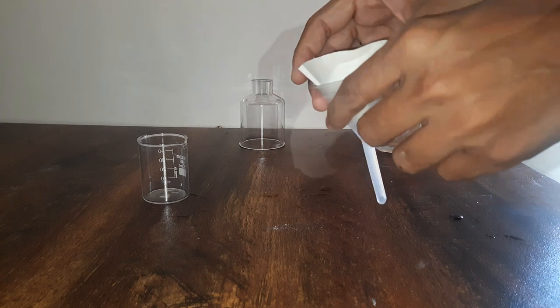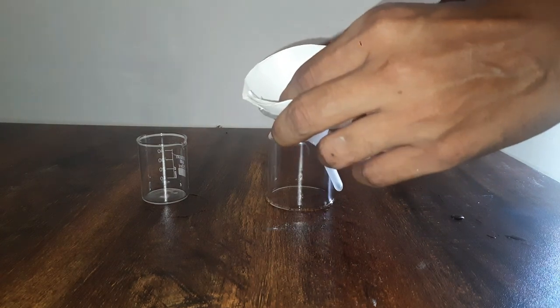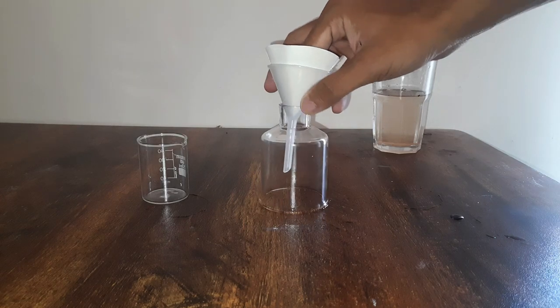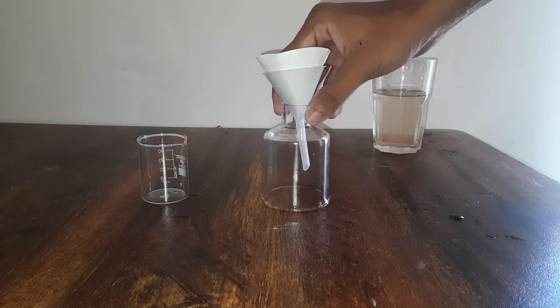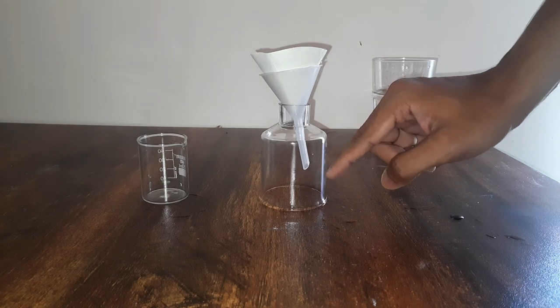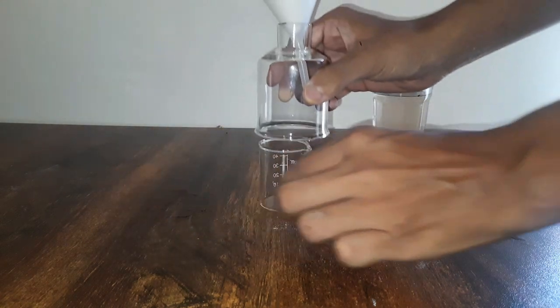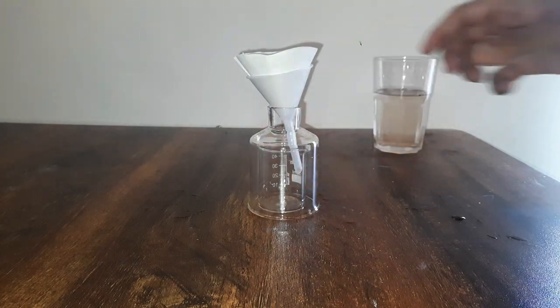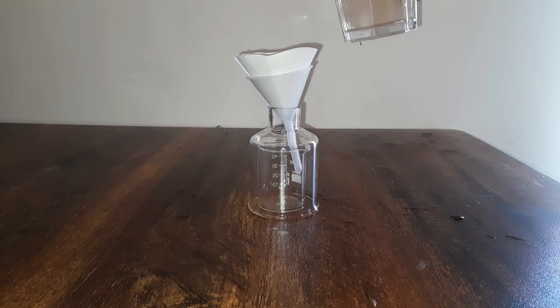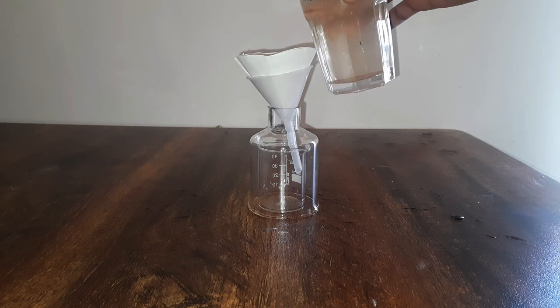Alright, this is good enough. Next, what we will do is hold this funnel in place — I am just going to place it like this — and keep an empty beaker below the other end of the funnel. Now I will pour this muddy water, this water with small sand particles, into this filter paper and wait for some time.